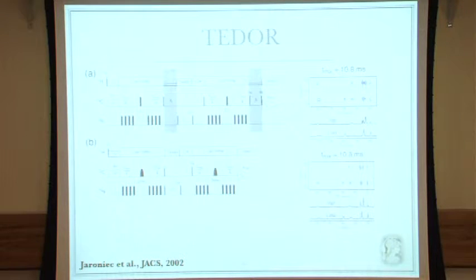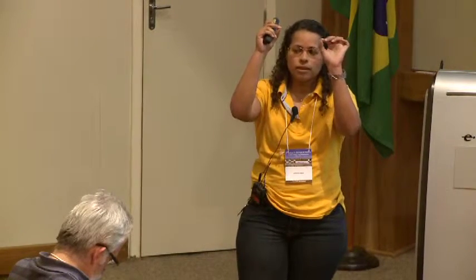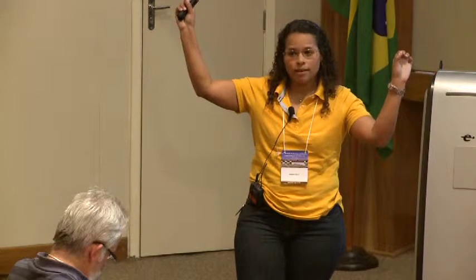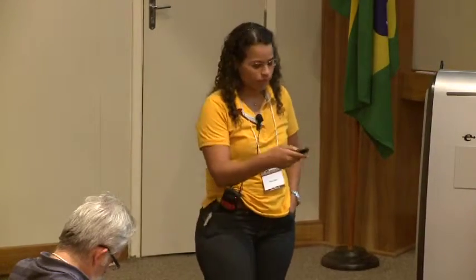And the nice thing is this delay here. That is extremely important because we have one behavior when you have two spins close to each other, you have a very strong dipolar coupling. But if they are really far from each other, you have a very weak one. And the extent of this dipolar coupling could be in the same range as the scalar coupling. And you can have the problem of scalar coupling in your spectrum.